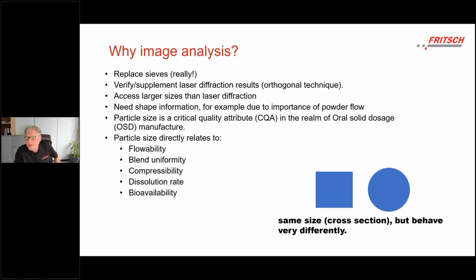And laser diffraction is very powerful in the micron and in the submicron range, but when it gets to larger particles, it's getting at least difficult or tricky. For sure, you can also measure particles in the millimeter range with laser diffraction, but that's not that easy.